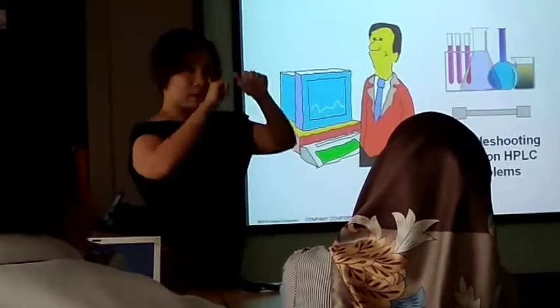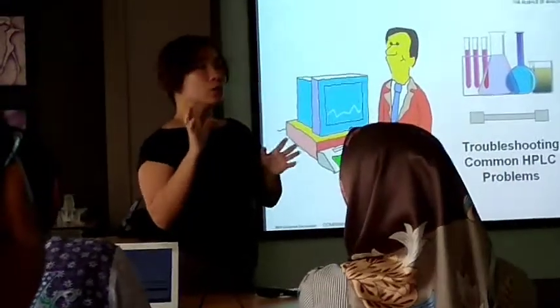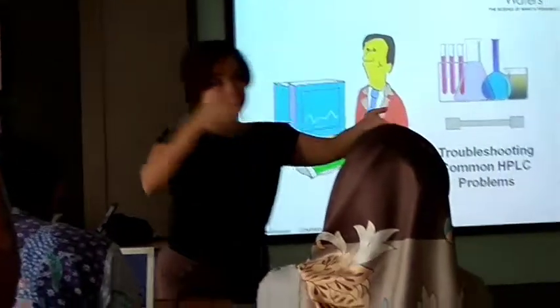Yes, I didn't touch on just now the power sequence. I didn't touch on HPLC. Okay, so the Alliance has only two modules, the LC and the detector. So you just have to power on the LC first, then the detector.